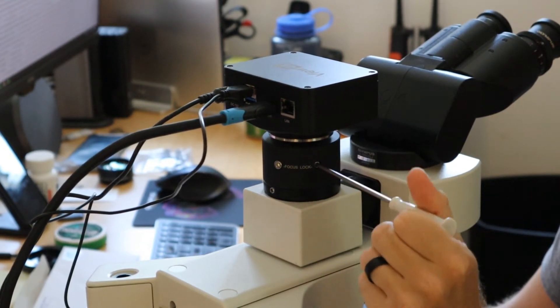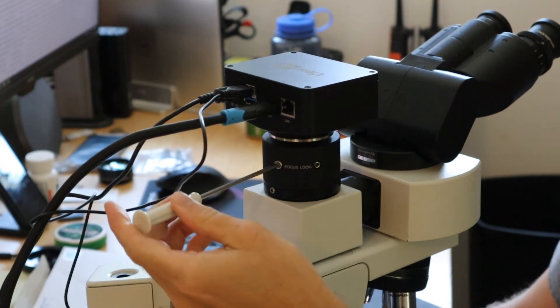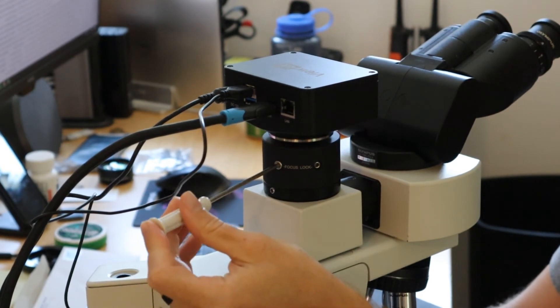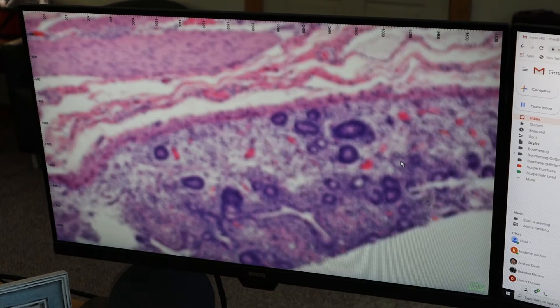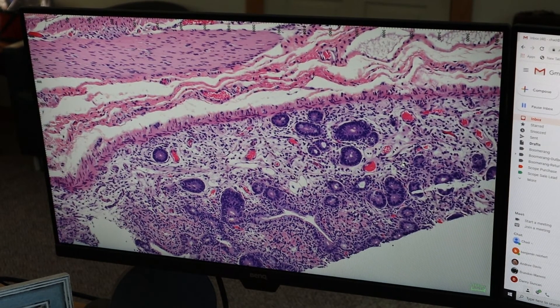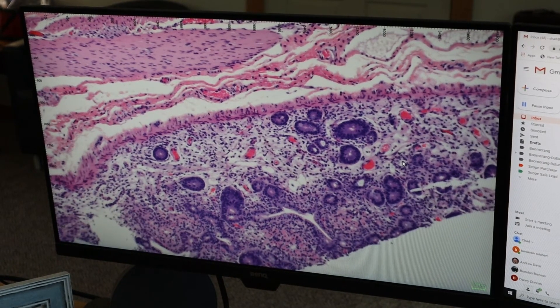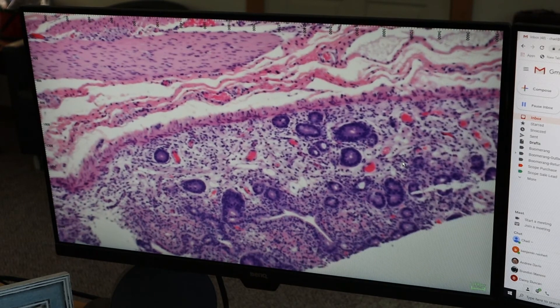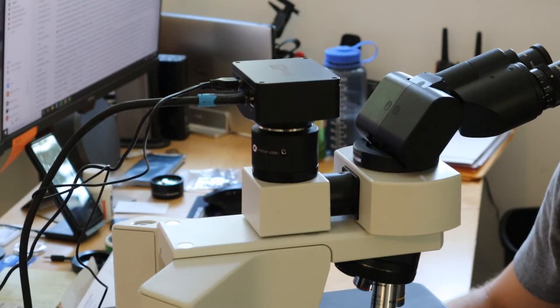First, you need to unlock the lock screw. Second, you need to put your three millimeter Allen wrench in the focus screw and adjust it until you see the image in focus on the screen. Adjust the image until you see on the screen what you see through your eyepieces. Once it's in focus, you want to remove from the focus screw, hold it with your thumbnail, and lock the image into focus.